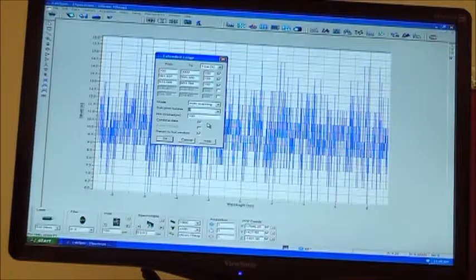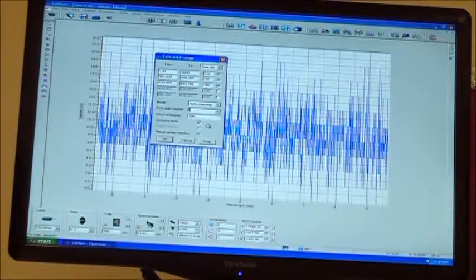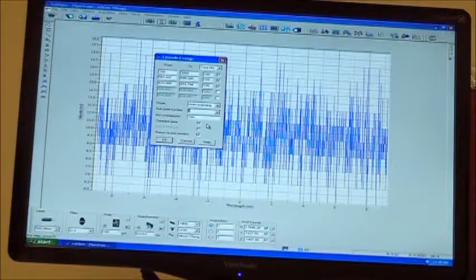Yes. And then it'll move in such a fine way, so you'll hit the first pixel 4 times. Then it'll move over, then you would hit the second pixel 4 times. Then the third pixel 4 times, rather than just 1 time. It gets you an even better signal to noise ratio, but everything you do, you'll see when you play with it, it exponentially makes your data longer.